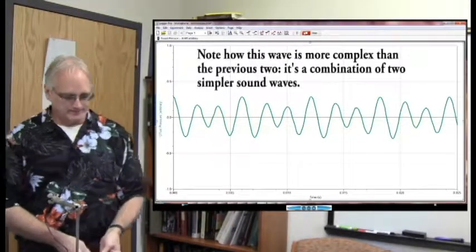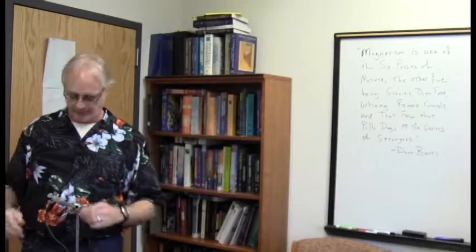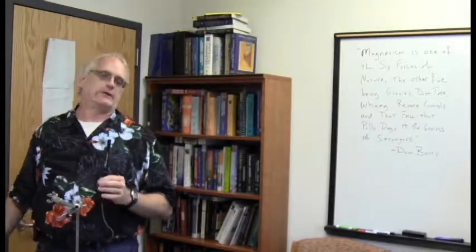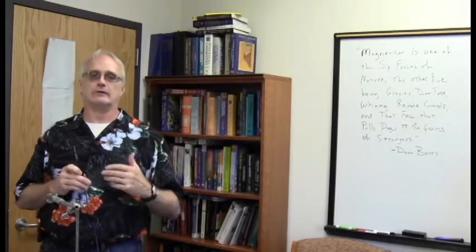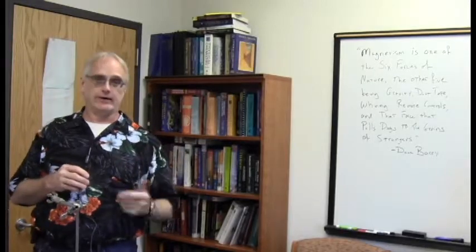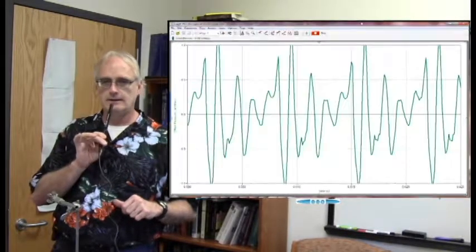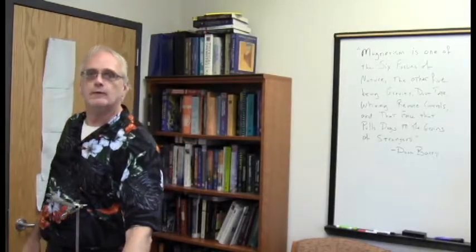There. Now, the ultimate of this, of course, is a really complex set of waves and sounds that are all mashed together. And so to show that, you are in the enviable position of being able to listen to me sing a note. So here we go. This is what my voice looks like when all the different sounds are analyzed and put on display. La la la, la la la. I know, I should stick to my day job, and I probably will.